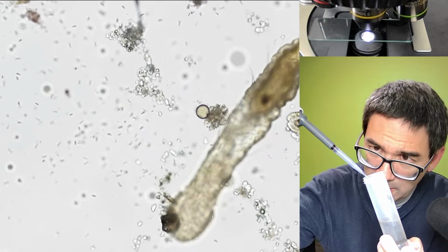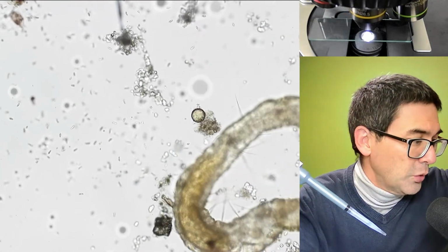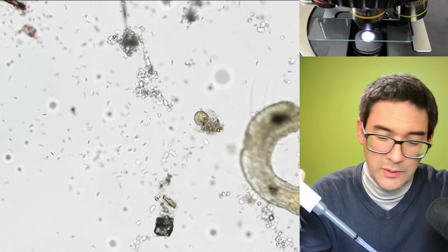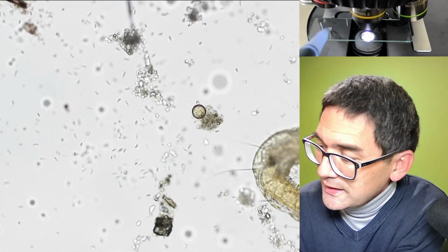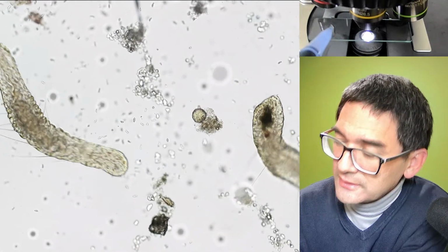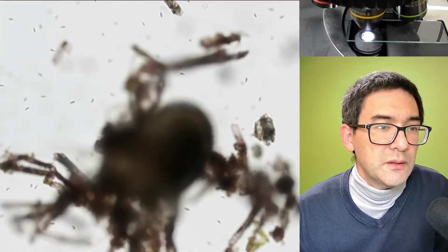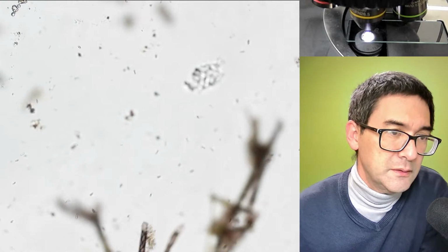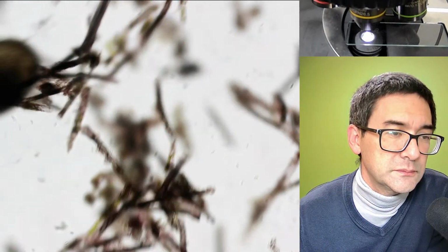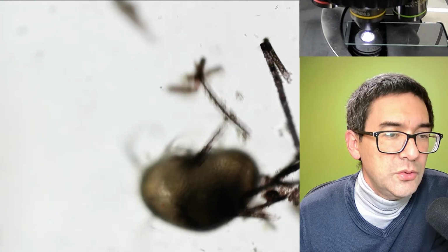So I've now taken up also a little bit of the sediment, hoping to be able to find something interesting there as well. You know what, I'm just going to put it directly on the place next to the slide. So let's have a look. Ah, what is this? Yeah, this is a huge ostracod. Yeah, that's a huge ostracod here.